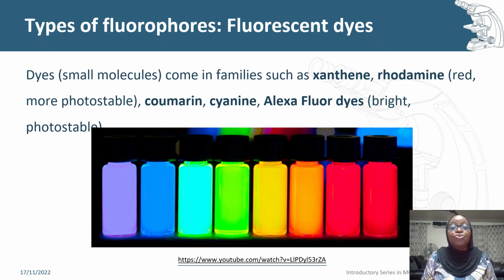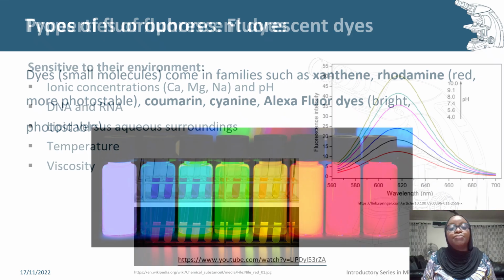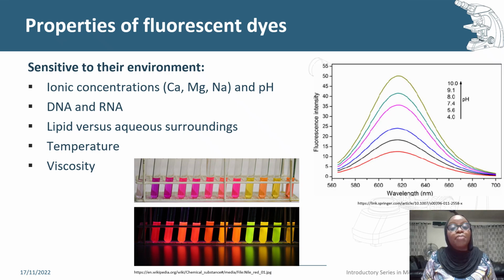This photo shows a whole spectrum of colors represented by the fluorescent dyes. The properties of these are that they can often tell us interesting aspects of their environment. They are very sensitive to the environment. They can act differently in different environments, like high or low pH.